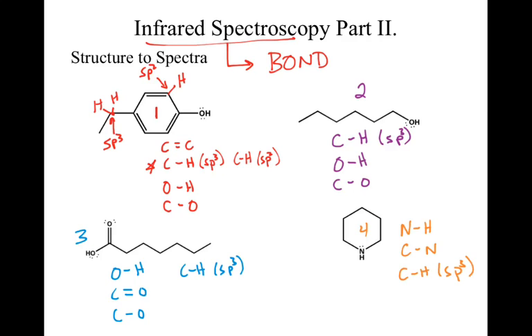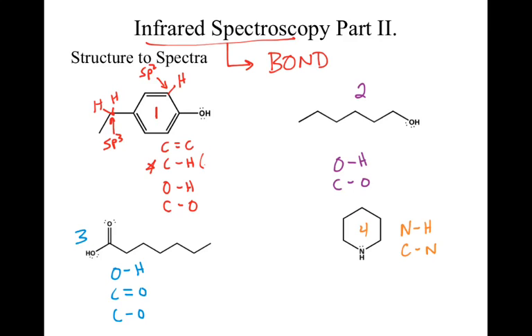To me, that means useless. So I'm going to go ahead and erase those. Why would they be useless? Well, they all have CH-sp3s. That's not going to help me at all because all of those would show it. So that's not going to be very useful. I happen to erase the wrong one up in our red one, so we'll just tweak that red one a little bit, make that an sp2.